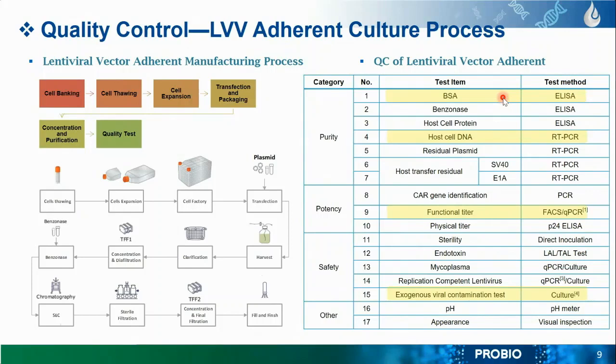Furthermore, the development of faster, more accurate tools, like the assays you can see here, is needed, and it is time-consuming. Especially, we usually go for qPCR, which is usually the method of choice. Droplet digital PCR, ddPCR, has been recently used for quantifying viral genome, and ELISA is also widely used for viral antigens.